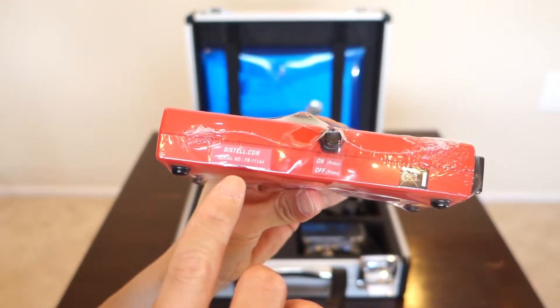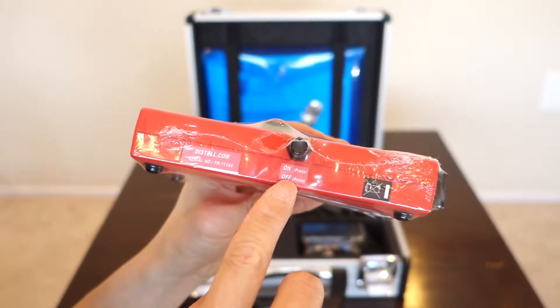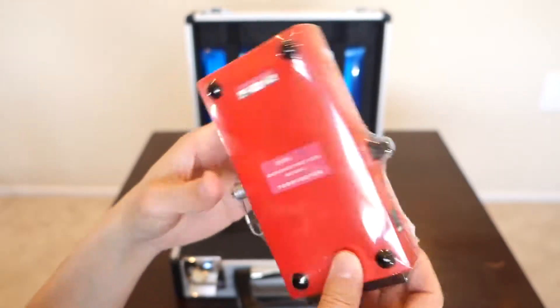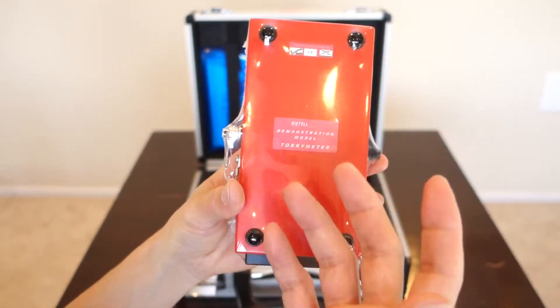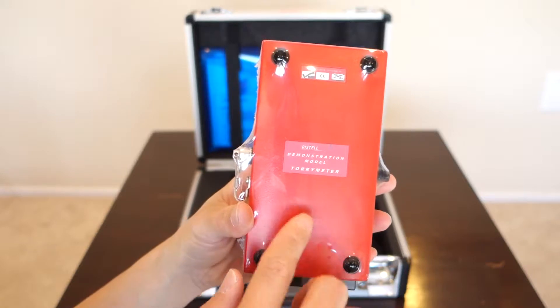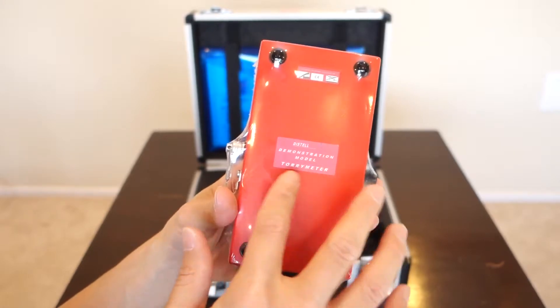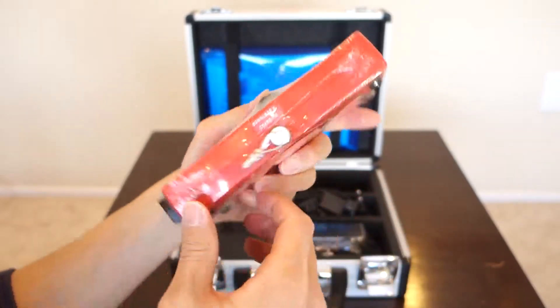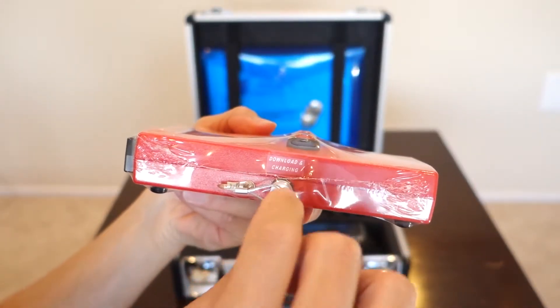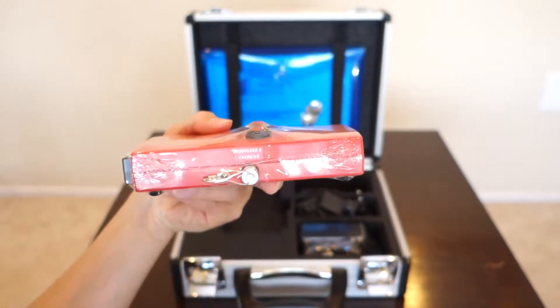On the side, it's still under wraps. It's got a CRE number and an on/off press, so this is the on/off switch if you want to turn it on and off. Because I'm a reseller and distributor of these products, I got this as a demonstration model, so for folks purchasing it, this label obviously wouldn't be here. On the other side, there's a charging download cable, so you can download the data taken to your PC.